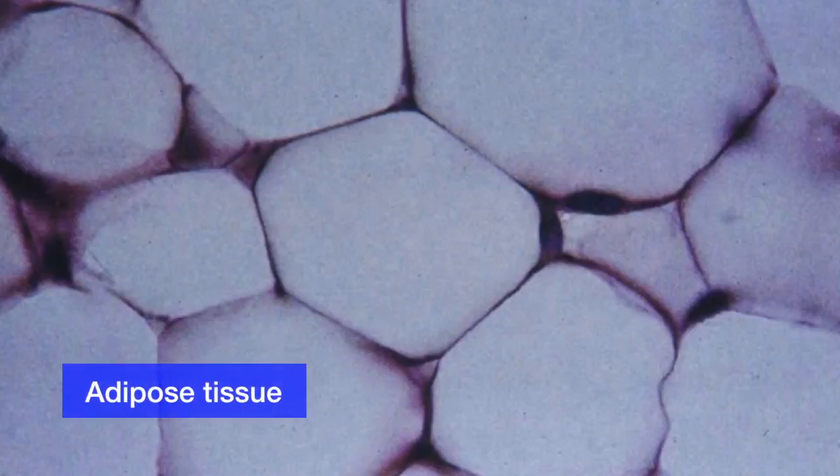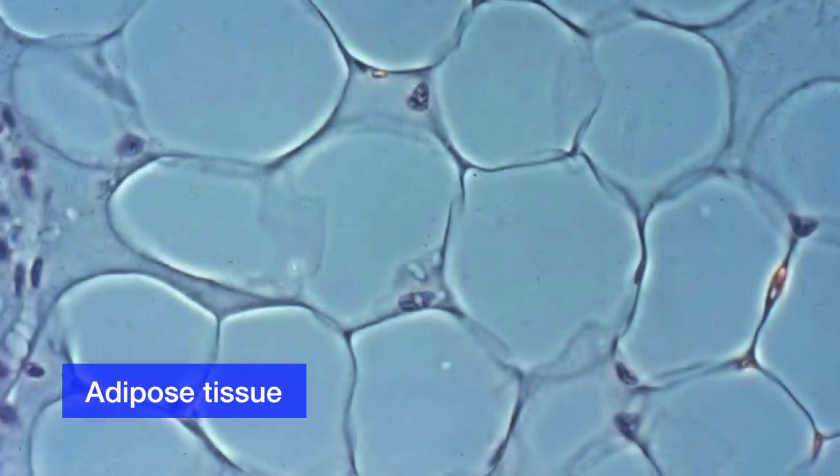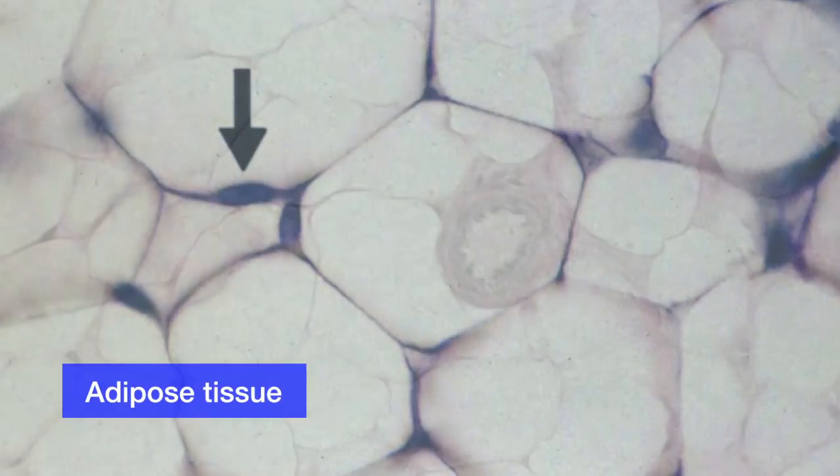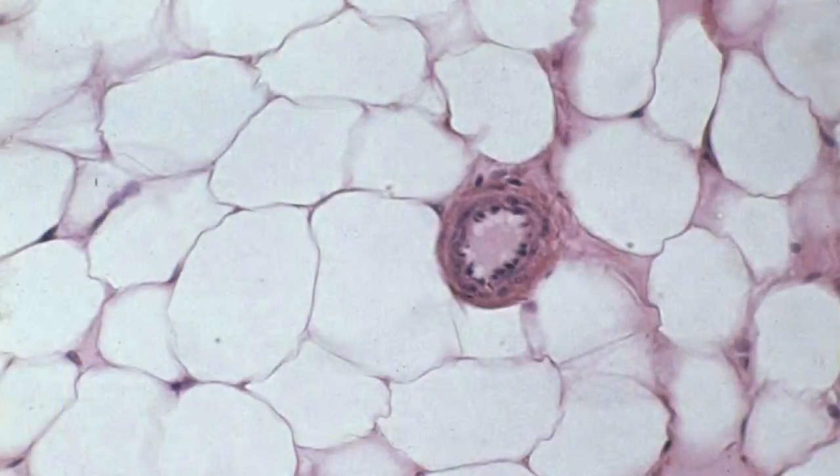Adipose tissue contains adipocytes. The cells specialize to store triglycerides or fats as a large centrally located droplet, and the cytoplasm and nucleus are pushed to the periphery of the cell. In the next slide, you see the adipose tissue with the very small dot at the periphery of the cell. It is the nucleus. And the next one is the same, and you see the arrow pointing at the nucleus of the adipose tissue. Adipose tissue again.